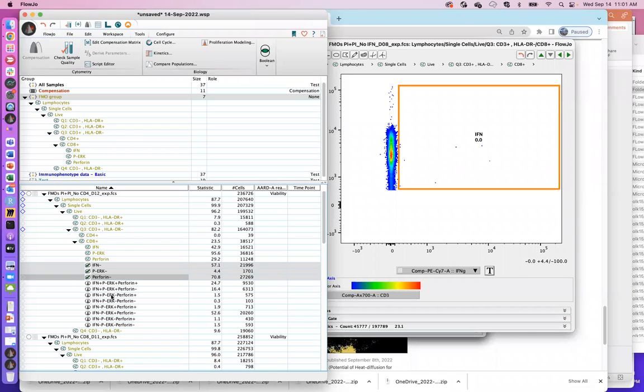Okay. So you can bring over, let's say these are the gates you're interested in. You bring them over along with their slash mark siblings. Don't forget to copy these. You don't have to copy over all the AND gates, all the permutations if you don't want, but just carry over these guys. So it's a fast tool to be able to figure out many permutations at once.